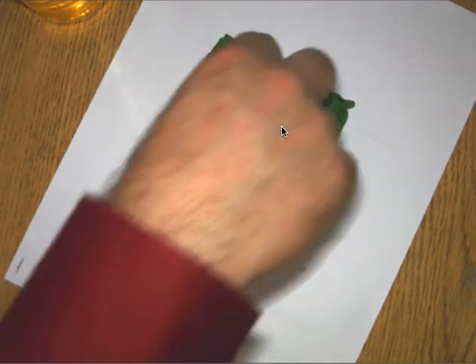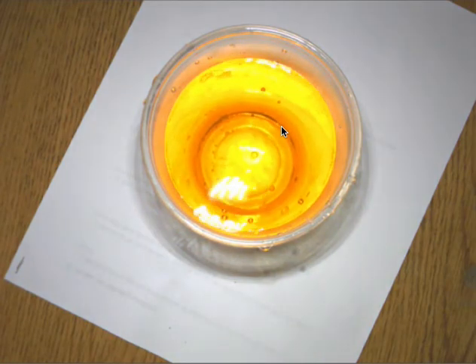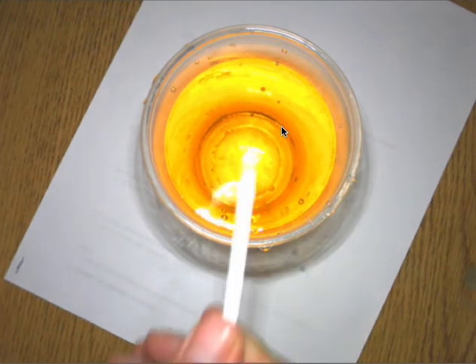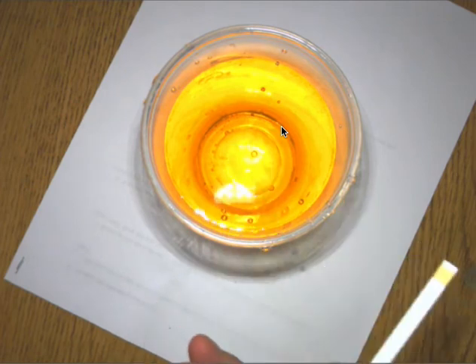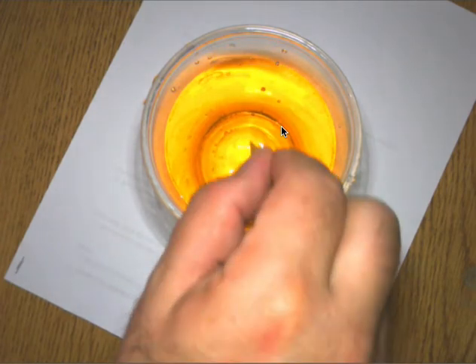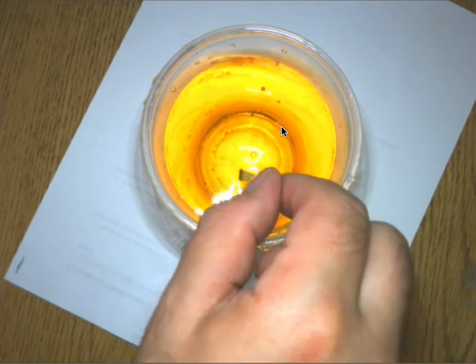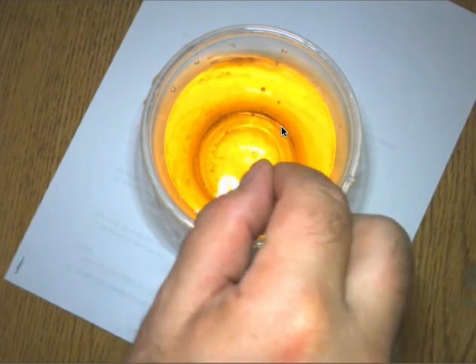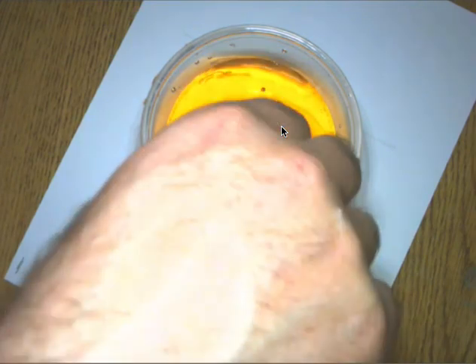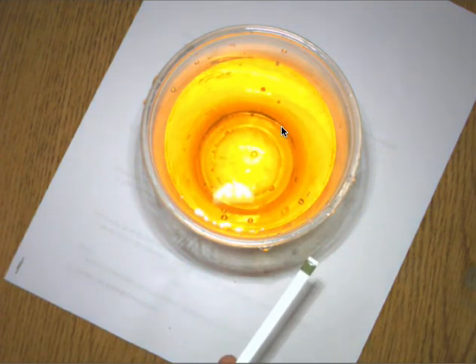Now let's take a look at the tube, or the cup. Looking at the cup here, it says, what color is it? All right, is glucose present? Well, to do that, now we take one of these strips right here. Glucose test strip. Take it, place it into the cup. If it darkens and turns green, then there's glucose present. So with the tap water, there was none, but now, let's take a look. Sure enough, there's now glucose present in the cup.